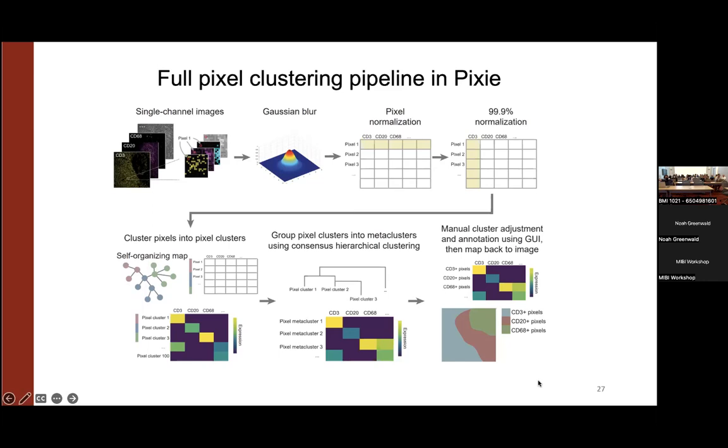Not to sound like I don't know the answer to all these questions, but I think it's very data set specific. For instance, in the brain example that I showed, Sunya and Sean's lab generated those images, and I believe she's doing some sort of neighborhood analysis, still a work in progress, to look at what other pixel clusters, if you're looking at the axon pixel cluster like I showed, are in its surrounding.